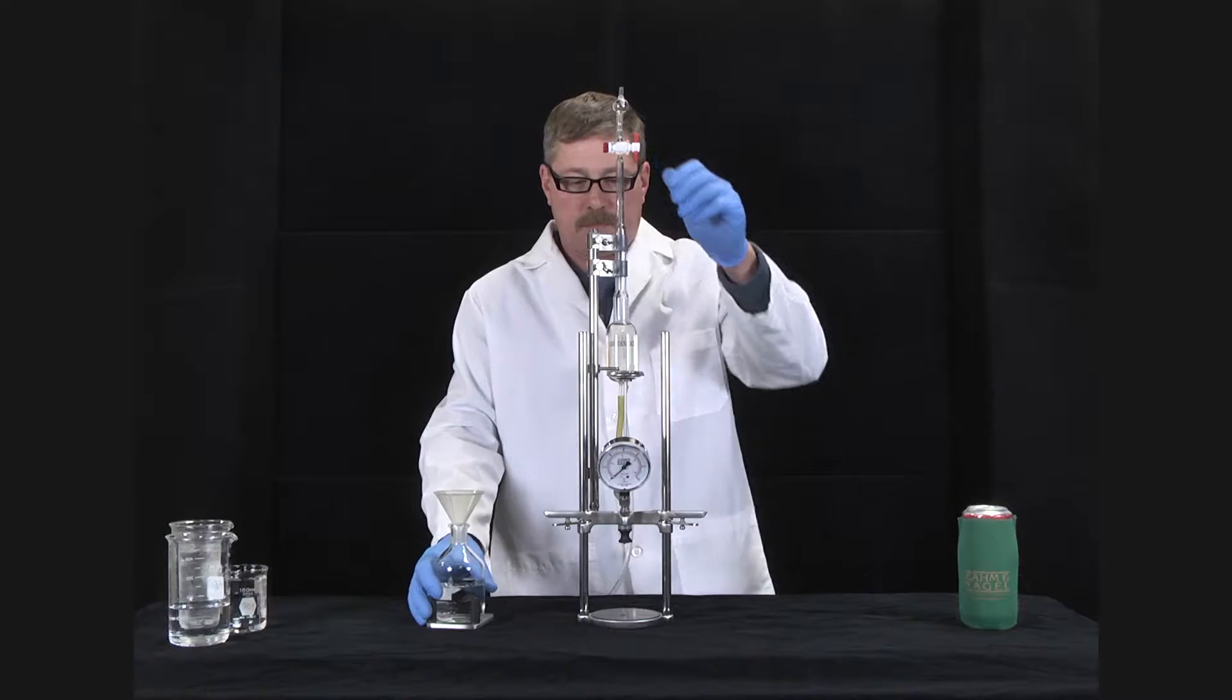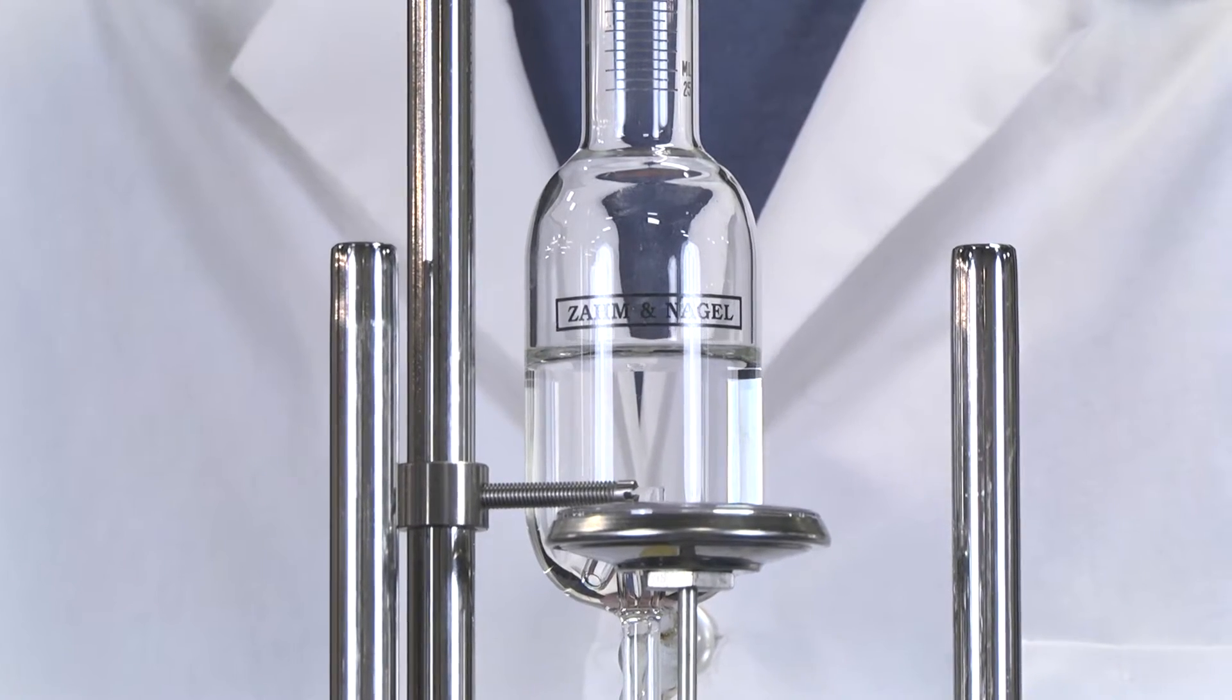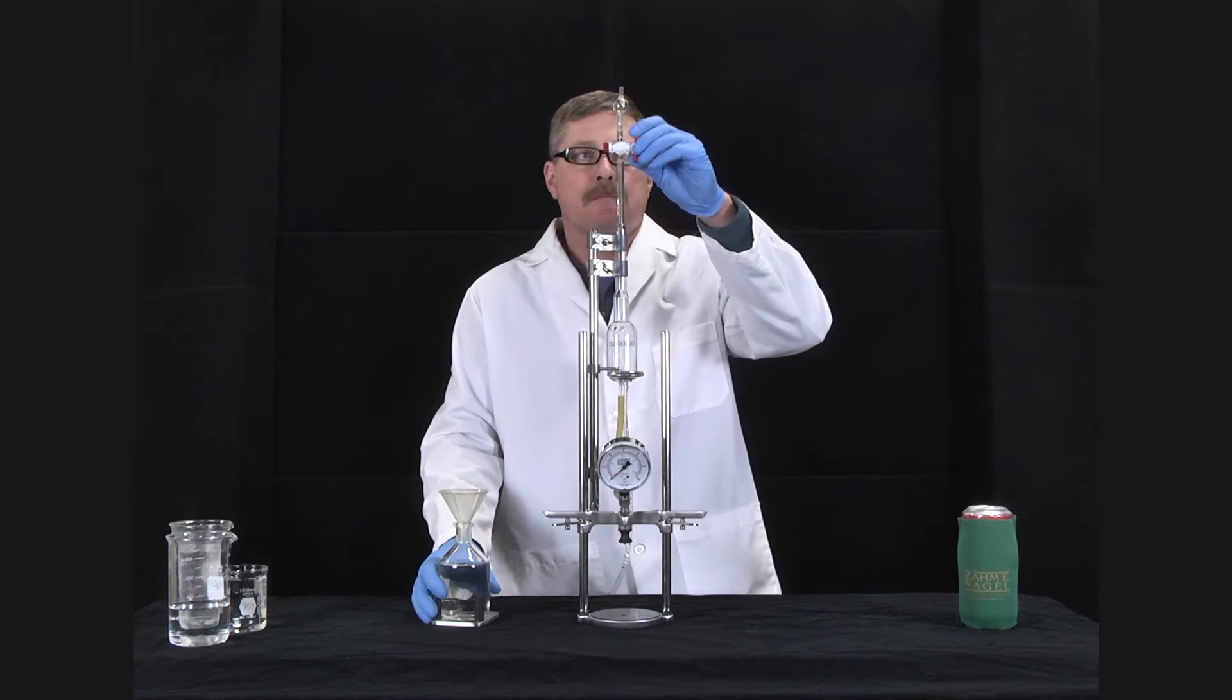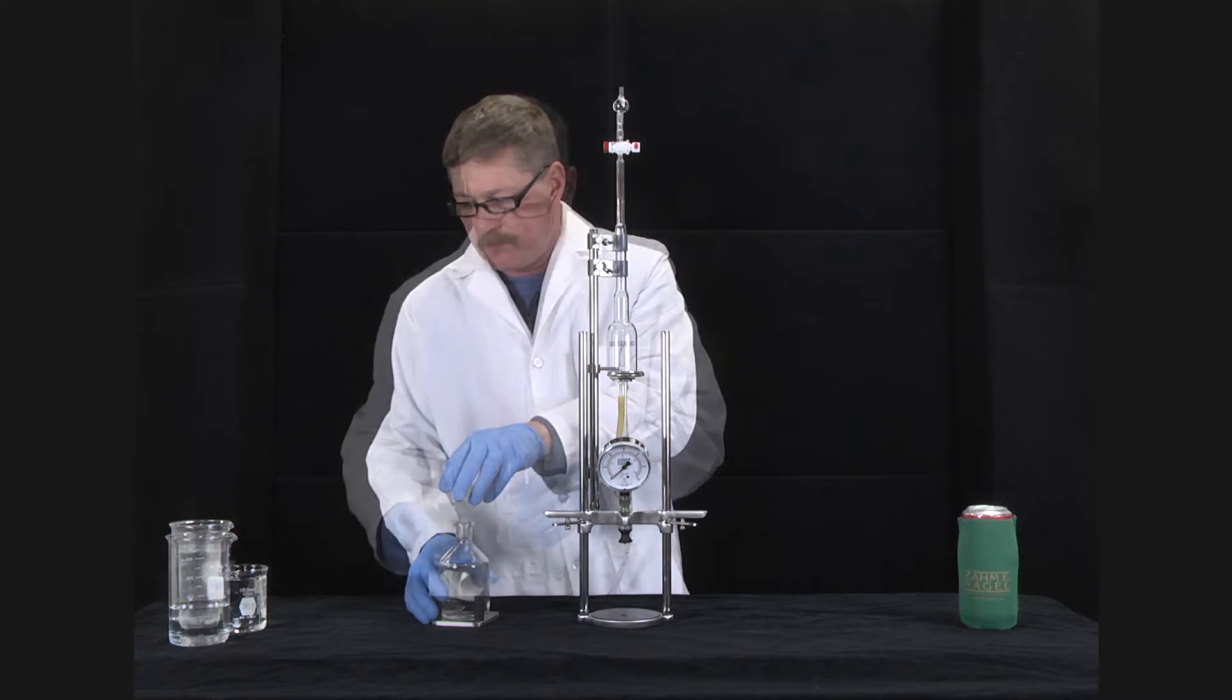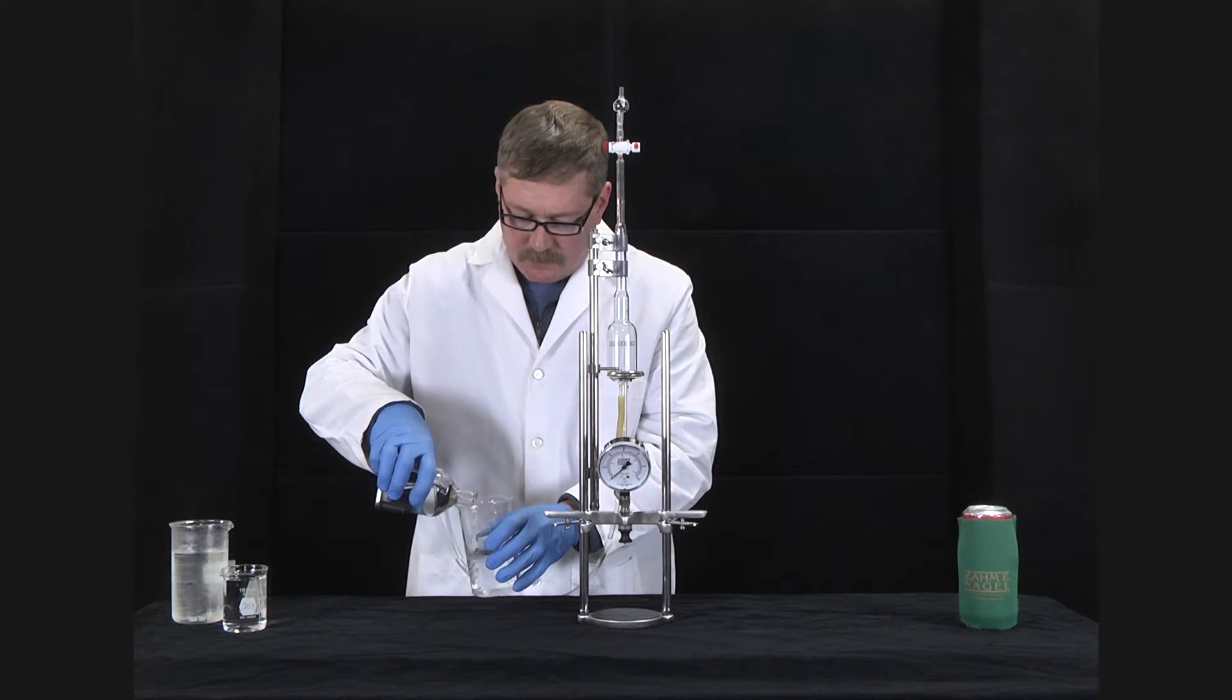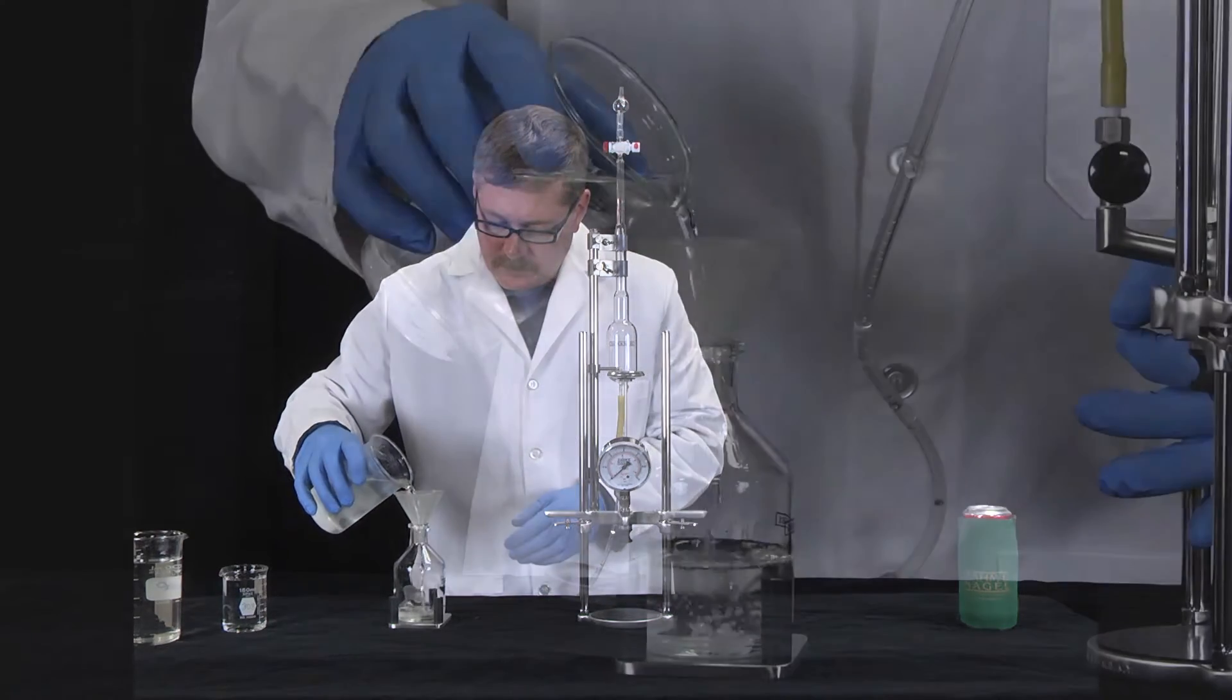Open the burette cock and allow the water to return to the level bottle. Close the burette cock and discard. Replace the water in the level bottle with caustic solution.